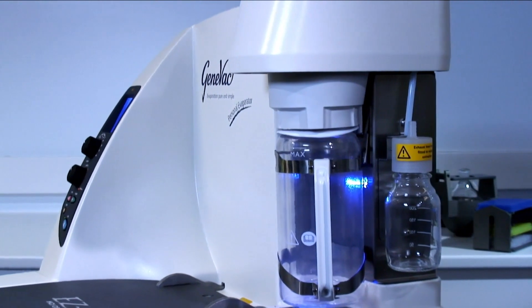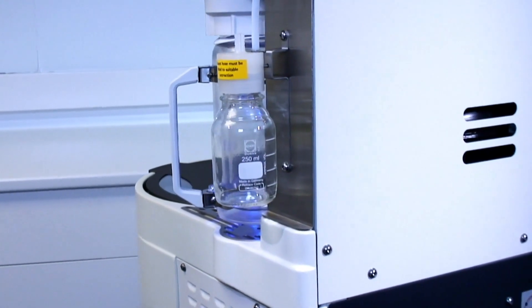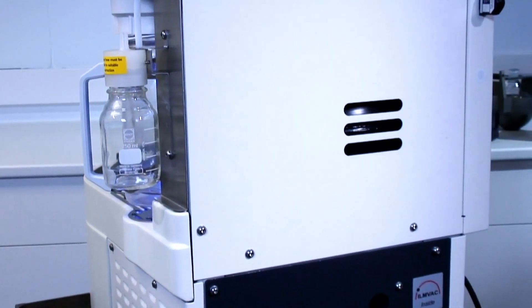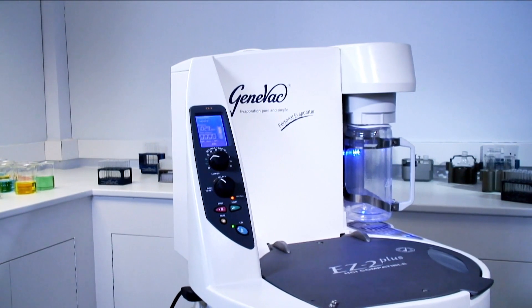The EZ2 will accept anything from two 500ml round-bottomed flasks to eight shallow well microtiter plates. The EZ2 is a compact integrated evaporation system.